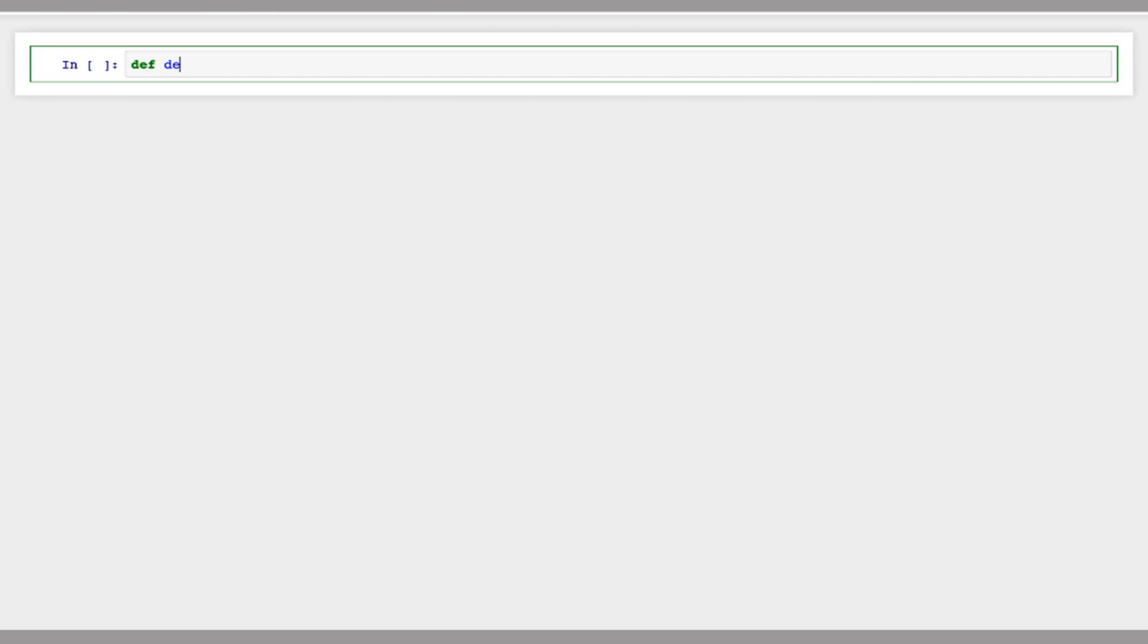In this practical, we're going to construct a de Bruijn graph from a string. So I'm going to create a function here, de Bruijnize, which will take a string for which we want to construct a graph and a kmer k that we want to use.